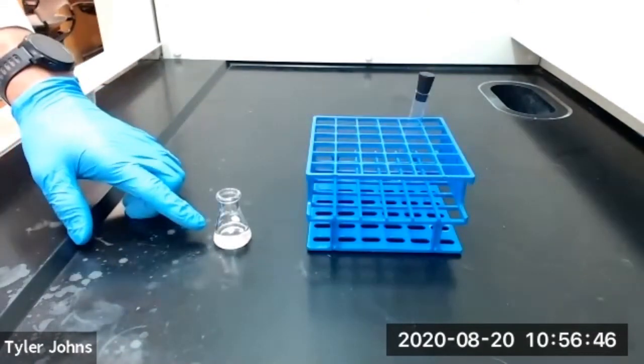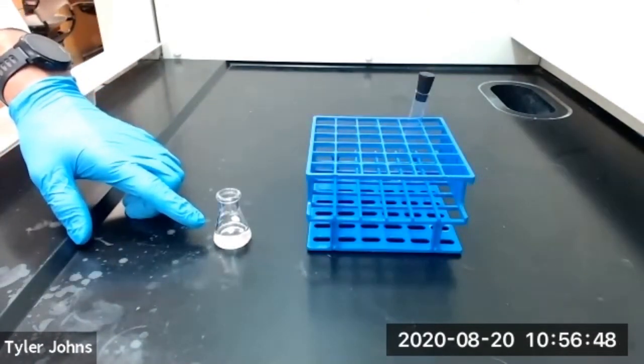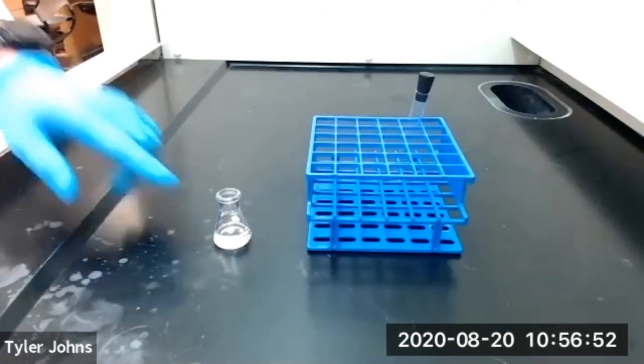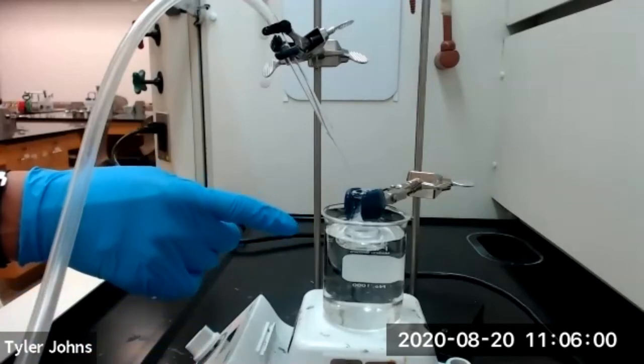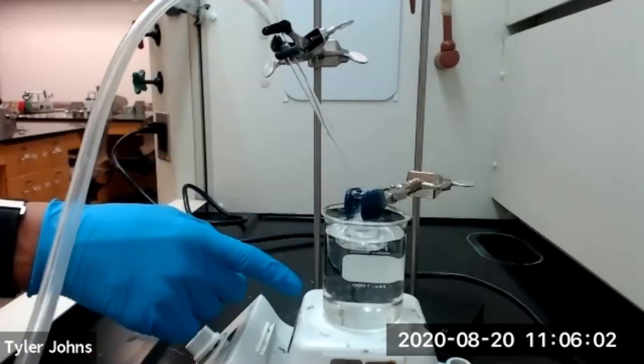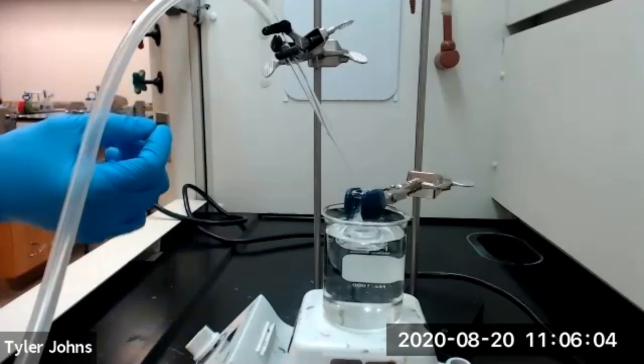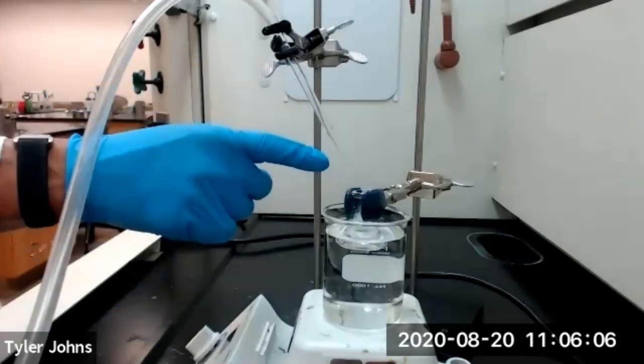We then need to evaporate off the methylene chloride in our 10 milliliter Erlenmeyer flask in a hot water bath. We're now evaporating the methylene chloride and aiding the evaporation using a stream of air.